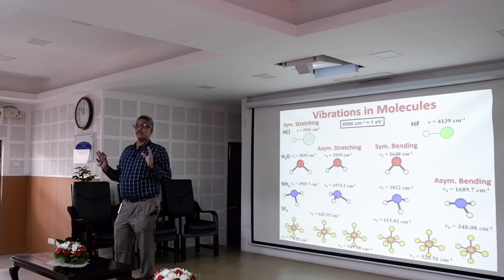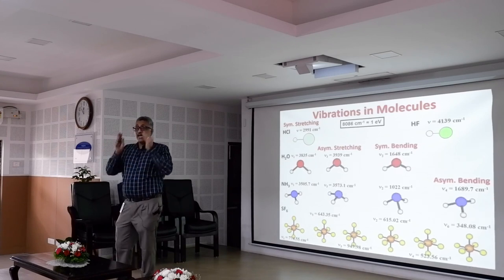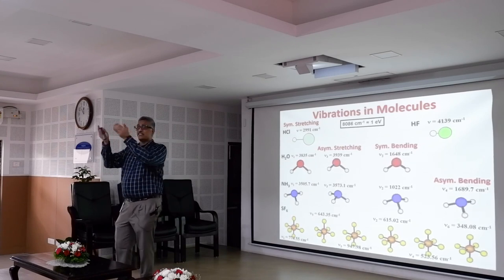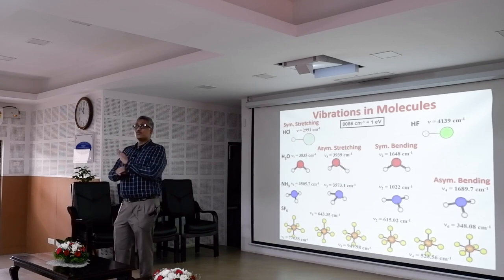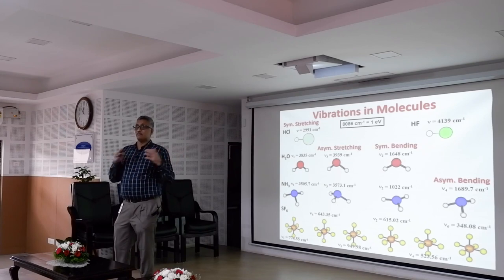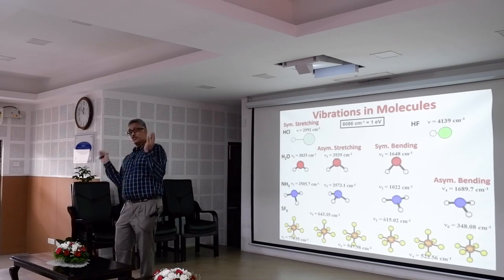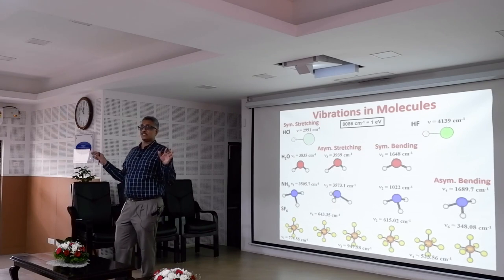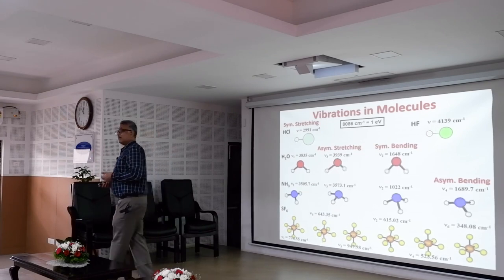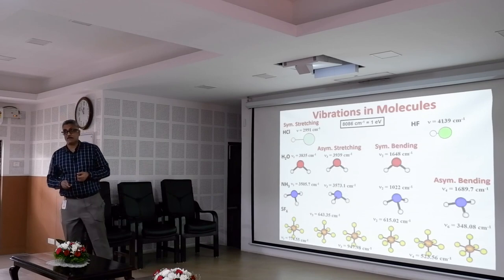Computers are there to tell me what kind of vibrations will be there. And they are so unique that I can actually see those vibrations. You can even demonstrate how they vibrate. So today we do not have to do this mathematically. We can do it by computers, and you can get all of these vibrations done. And you can understand what the energy of these vibrations are.